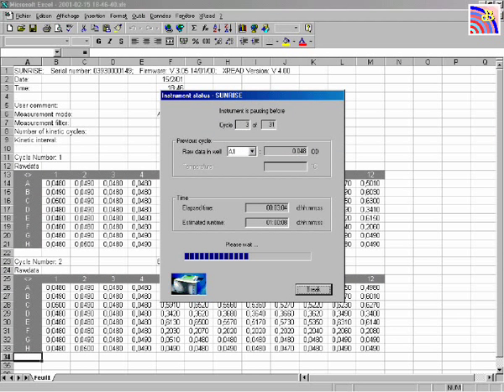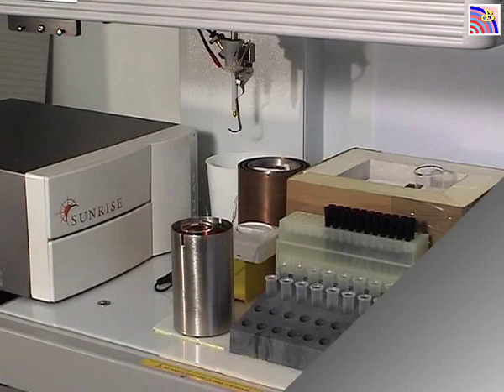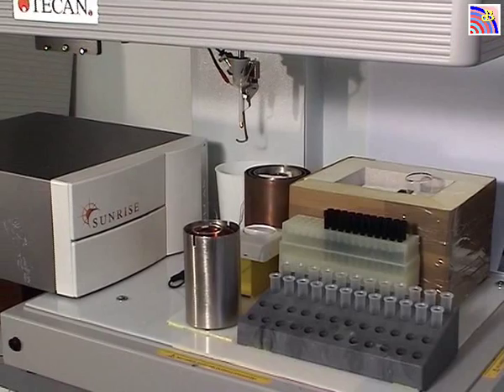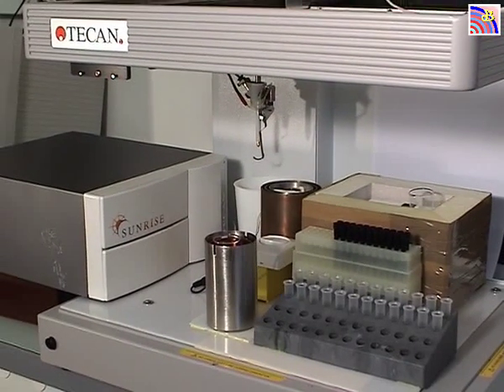And this is what appears on the computer. Now we are reaching the end, and the plate will go out after one hour.